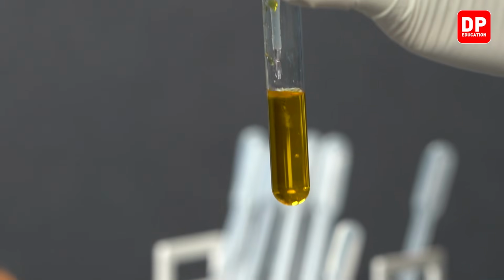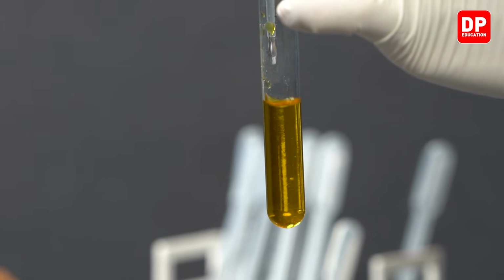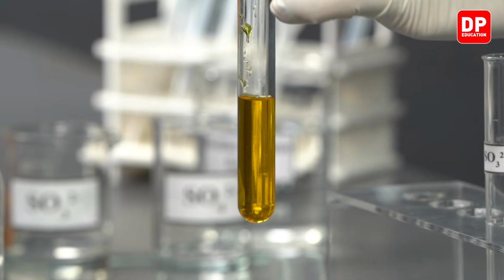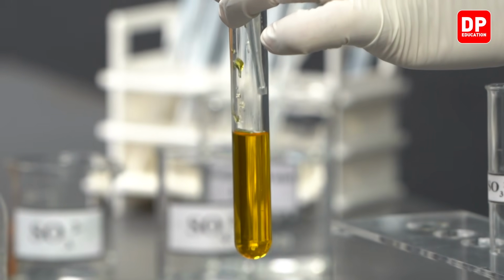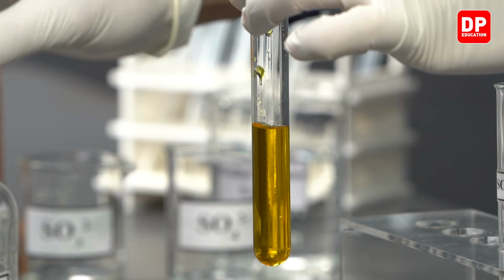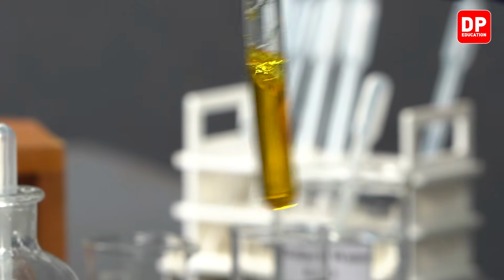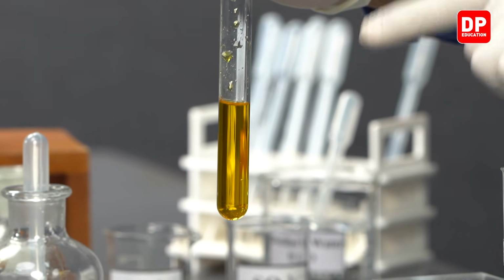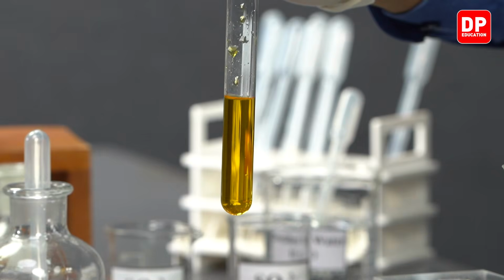Let's add a small amount of dilute sulfuric acid. Now we have prepared our acidified potassium dichromate solution.